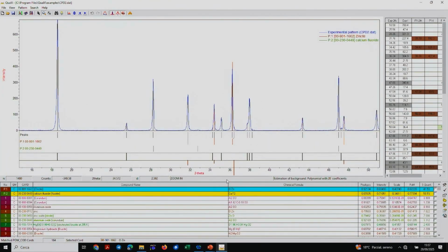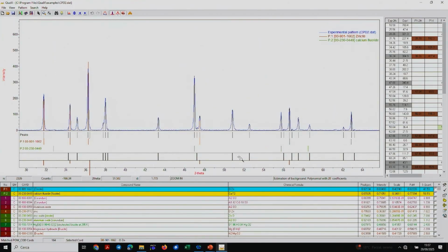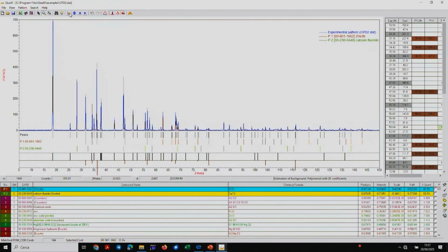That's fine. Okay. And we see here the peaks. As we see, the black lines are quite a lot. So actually, the problem could be that there's still something inside our sample that is not justified, and I have to look for it carefully.